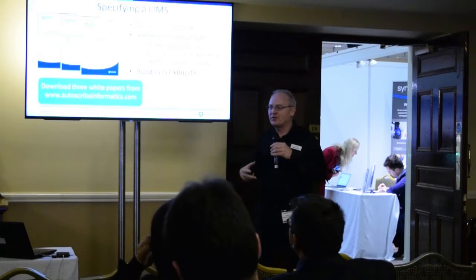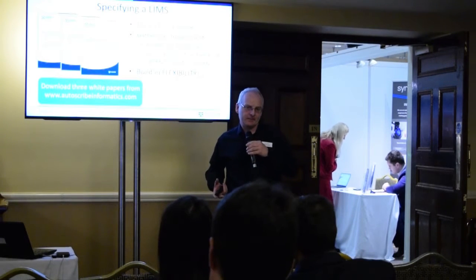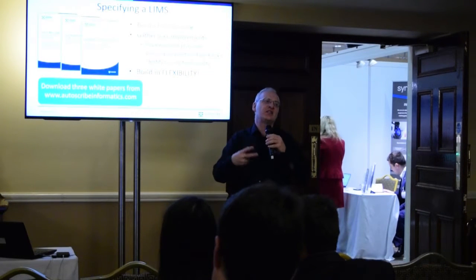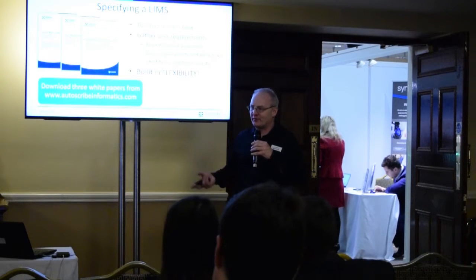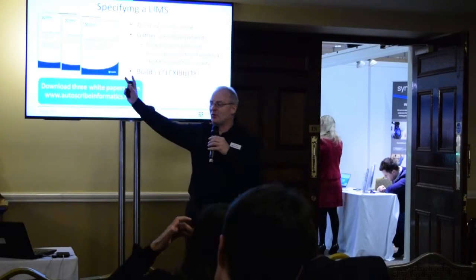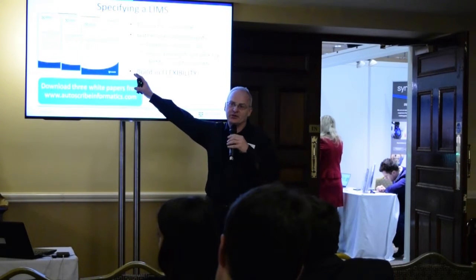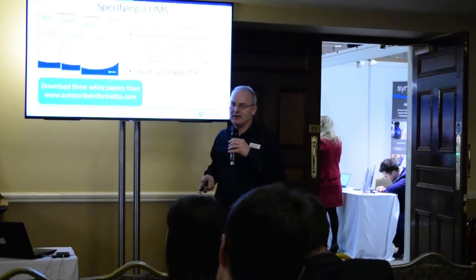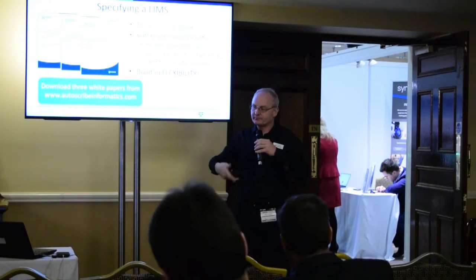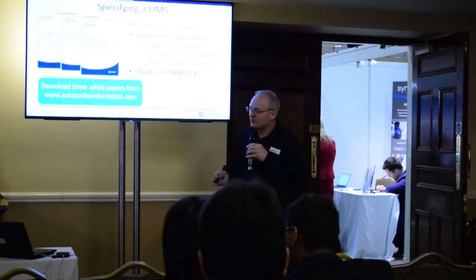So we know we have to do several things to get to a LIMS software which is going to be 17025 compliant. And your task on the other side is to specify the LIMS you want. And that's not as easy as it sounds, because the LIMS providers all have different flavours and slightly different ways of doing things. The three documents you might want to think about downloading and looking at are how to buy LIMS, justifying a LIMS purchase, which tells you things you might be able to justify LIMS on, the cost savings you're going to get, and the user requirements for LIMS, which gives you some hints as to what the LIMS is being used for and how you'd specify that to a vendor. So those are all good documents to download.